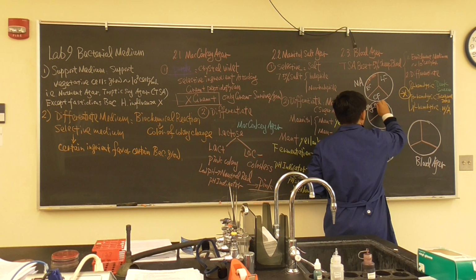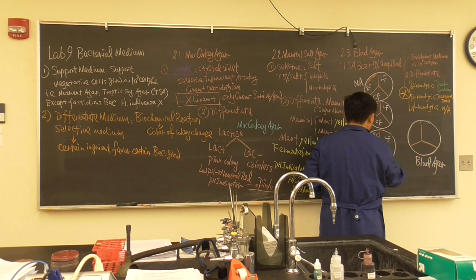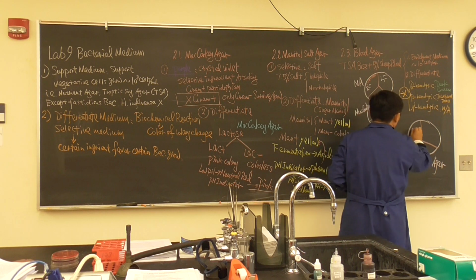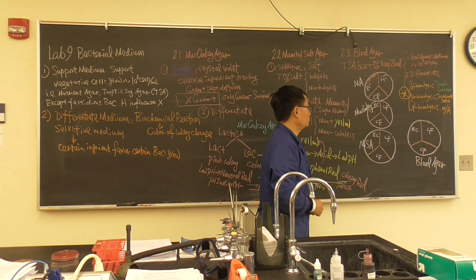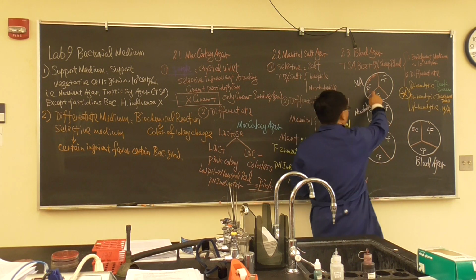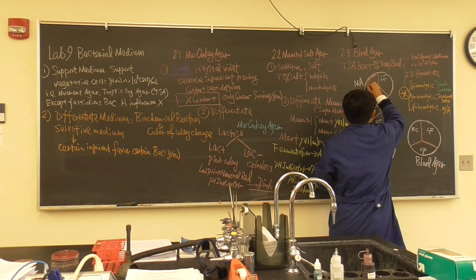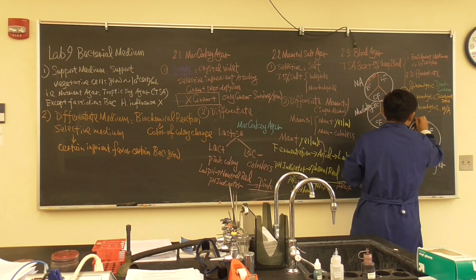Same thing here. EC, LF, and CF. We cannot do Staphylococcus aureus. It's a biosafety level 2 pathogen. Okay? This is your label. Of course, you're going to have to label everything, including your basic information here, here, and here. And this will be a pair.